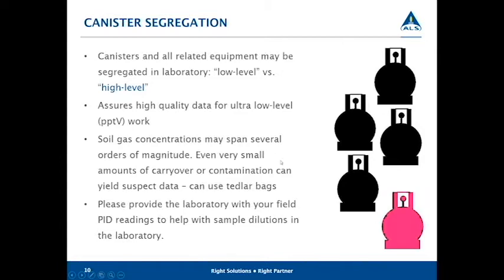Soil gas concentrations can span several orders of magnitude. We're usually dealing with high concentrations of TCE, PCEs, and very small amounts of carryover from these can yield suspect data. There's a note here saying that you can use Tedlar bags.